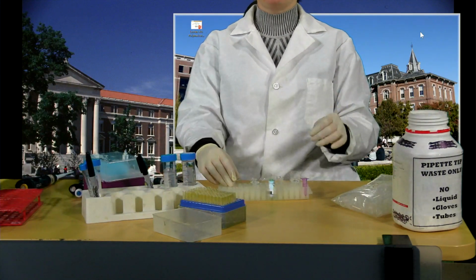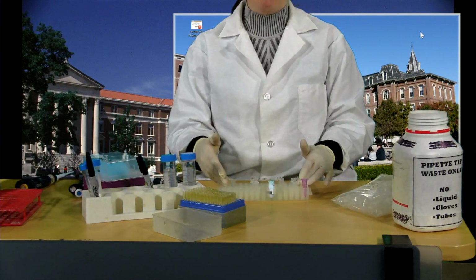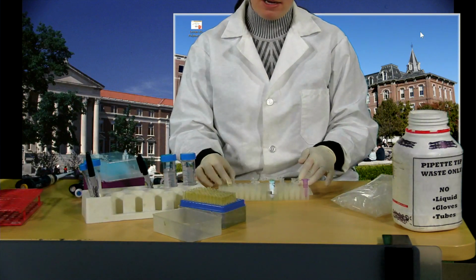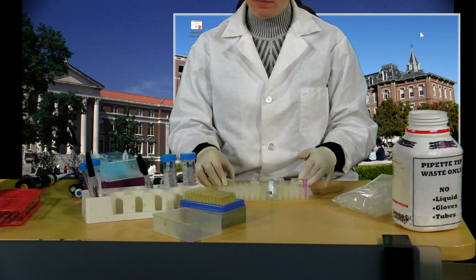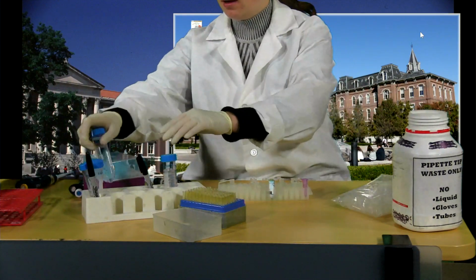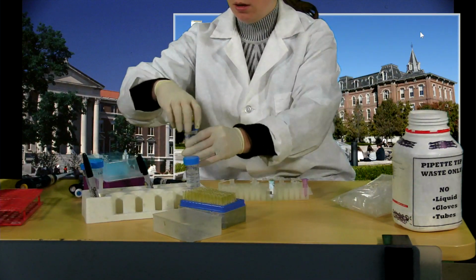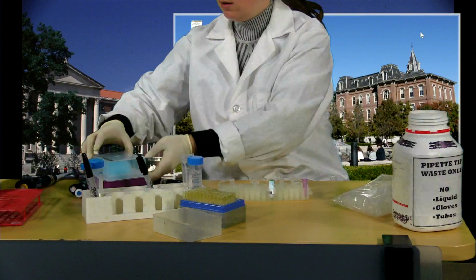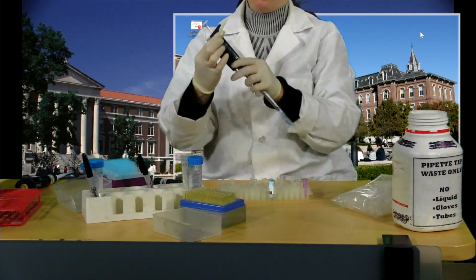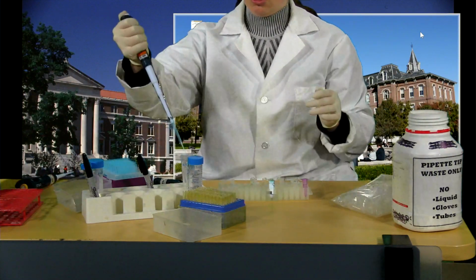You must do everything to it that you do to your fractions. It just should not have that one thing that you're testing. So we just don't want to put enzyme in here, but everything else will be the same. So what we're going to do is get some substrate here. Where is the substrate? Here we go. And I'm going to put 900 microliters of substrate into each of these tubes.